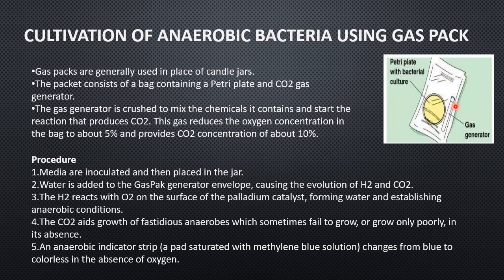Okay, so the media is inoculated and it is placed in the jar. Then water is added to the gas pack generator envelope, causing the evolution of CO2 and H2. The H2 will now react with the oxygen that is present on the surface of the palladium catalyst and it will form water. Okay, and this establishes the anaerobic condition.